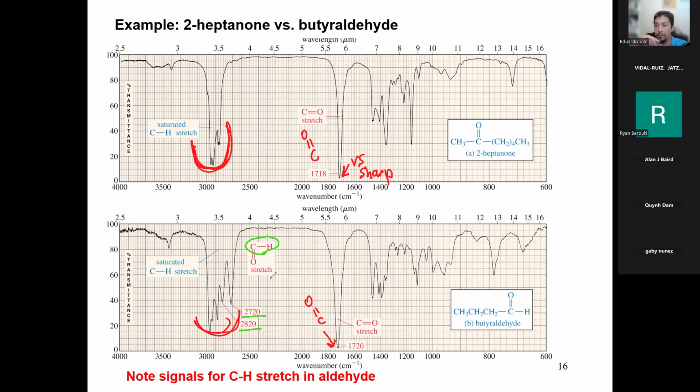And I showed you earlier in the animations exactly what an aldehyde looks like. So if you look at the top, it looks just like your standard run-of-the-mill stalactites, no big deal. But if you look at the bottom, they look a little different, and some of the peaks are a little lower than the rest. And also, just look at your structure. They give you the structure right there. You can see that there's an aldehyde, so you should expect an aldehyde CH stretch. You don't go into these blindly. You don't just get it without a formula or a name or an expectation. That's not possible. You have an idea of what you're working with when you're doing this analysis. You just have to justify, explain, and make educated guesses.